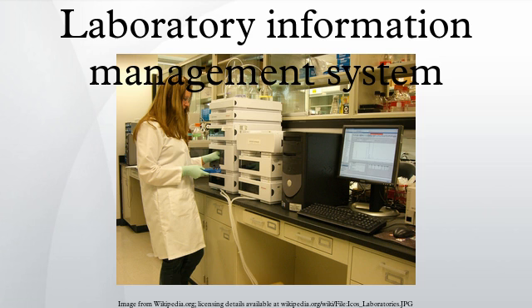Dr. Alan McLelland of the Institute of Biochemistry, Royal Infirmary, Glasgow highlighted this problem in the late 1990s by explaining how a LIMS is perceived by an analyst, a laboratory manager, an information systems manager, and an accountant, all of them correct, but each of them limited by the user's own perceptions.